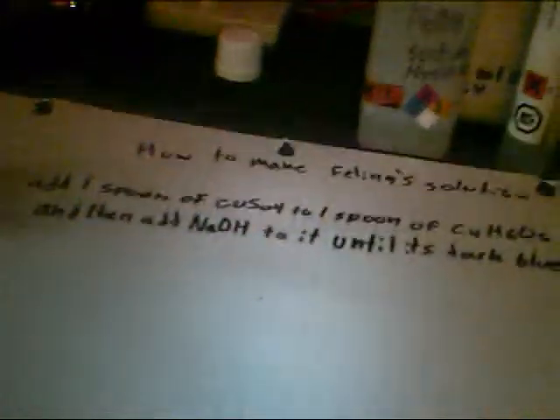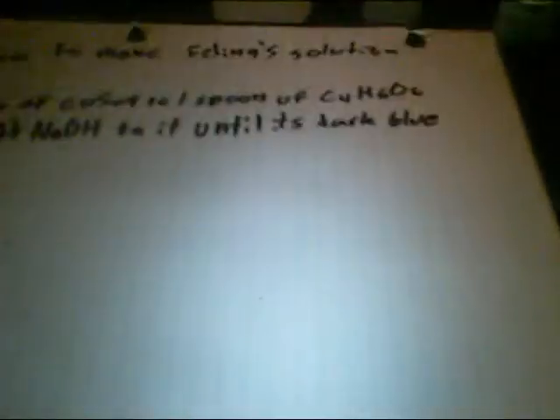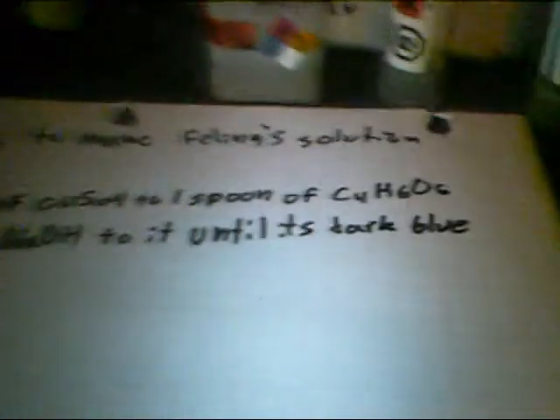Hello, this is a NerdAlert226 production and today we are going to make a feeling solution, a solution that is used to test glucose.